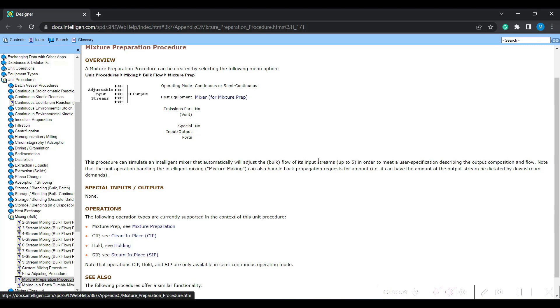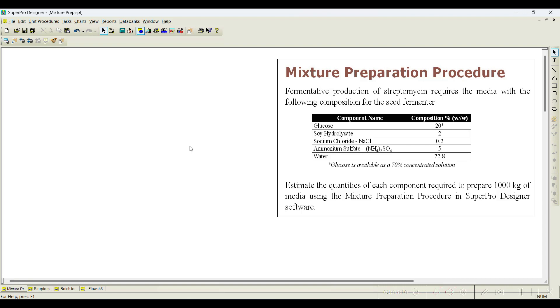You can add up to five input streams. The quantity prepared can be defined, or it can depend on downstream process requirements. For example, your fermentation or seed fermenter needs some quantity of media that you may not know at the initial step. This mixture preparation procedure also helps calculate the quantity required in later stages.